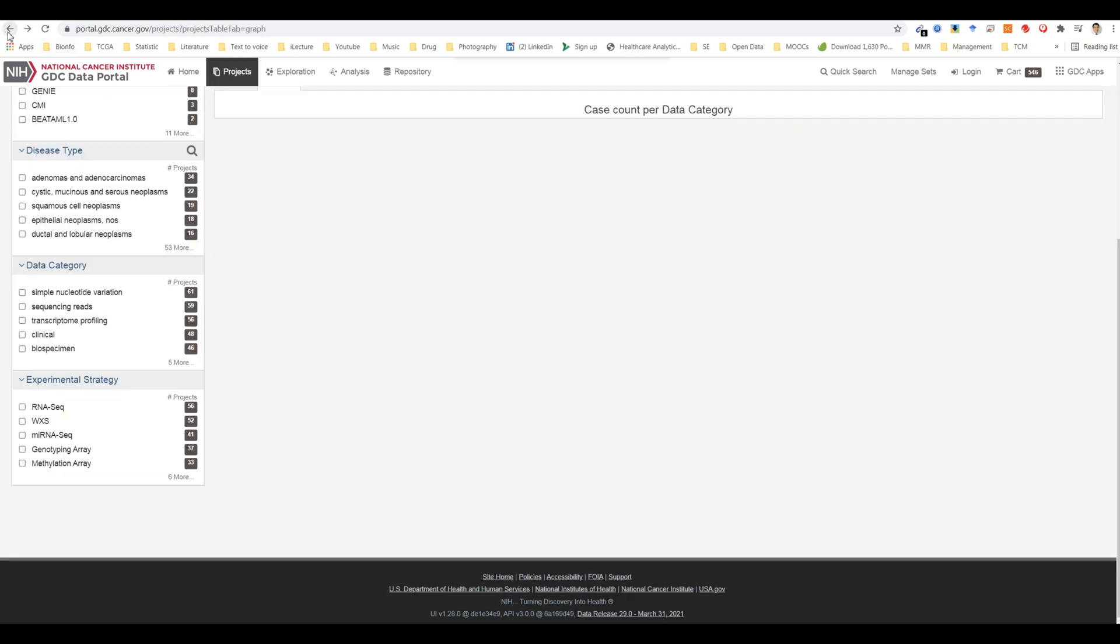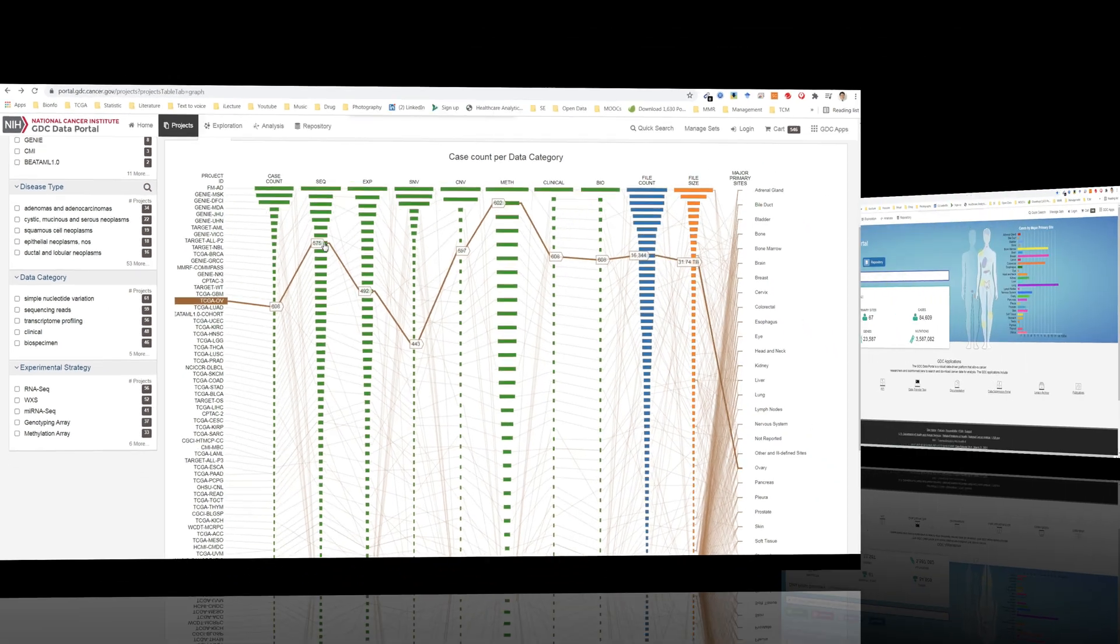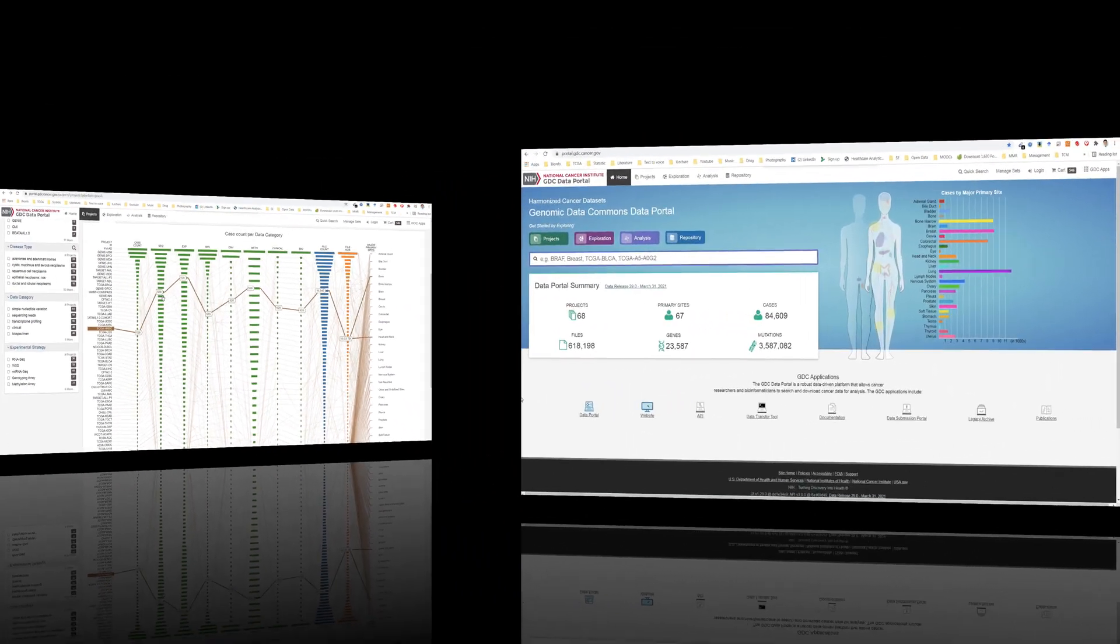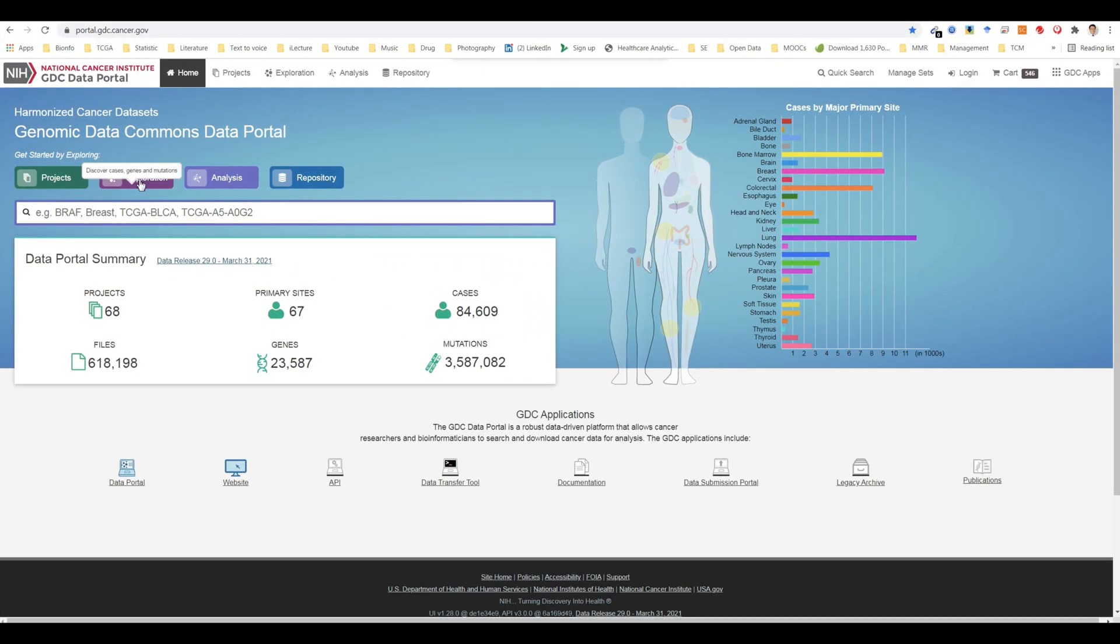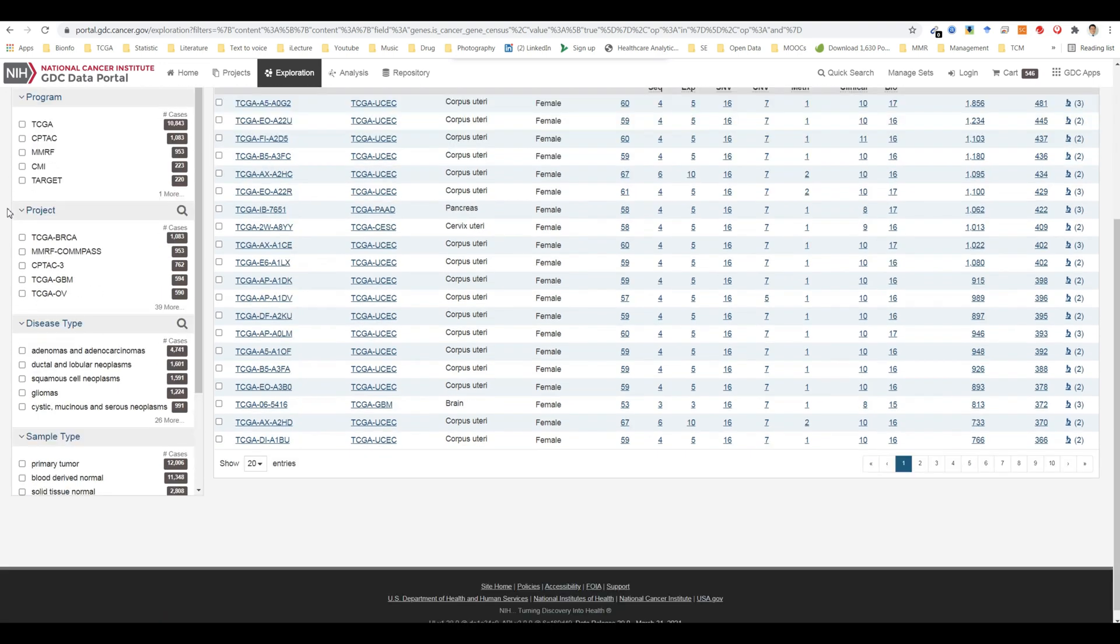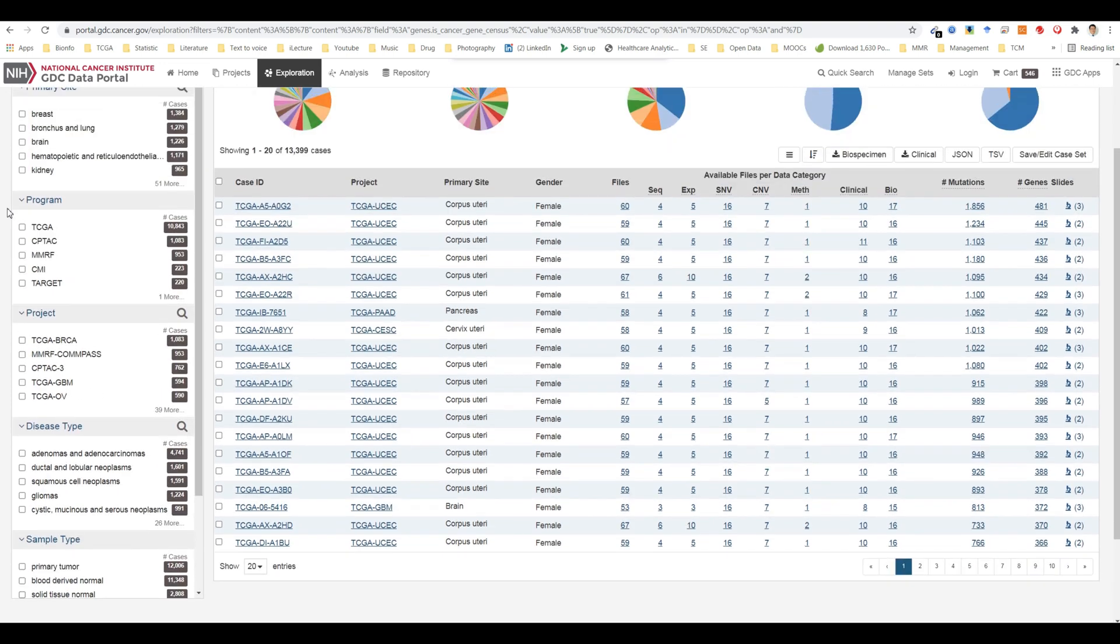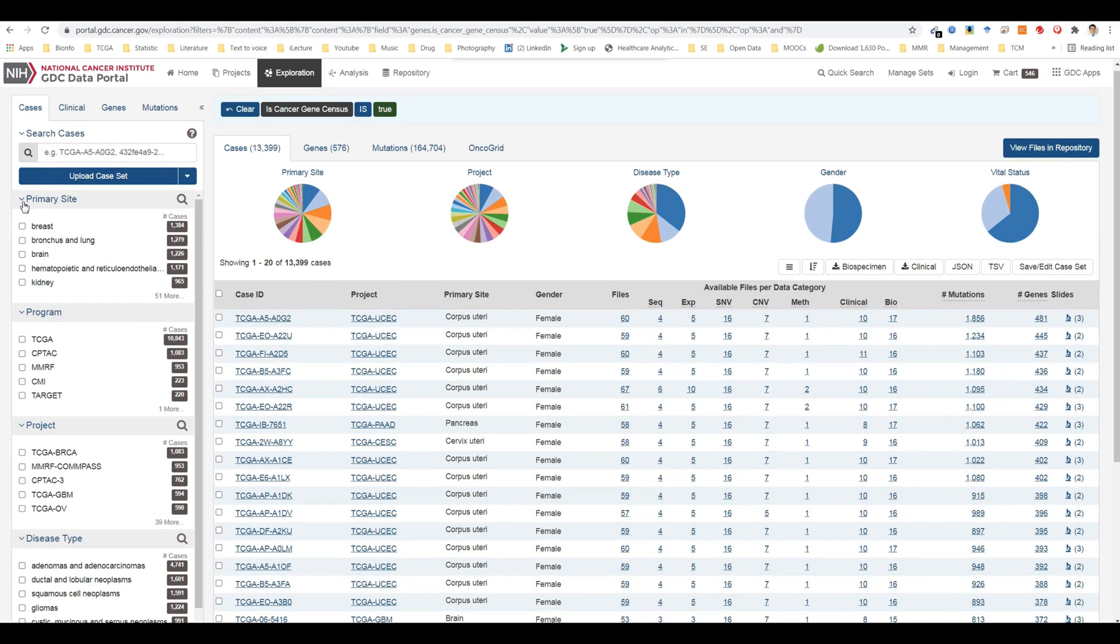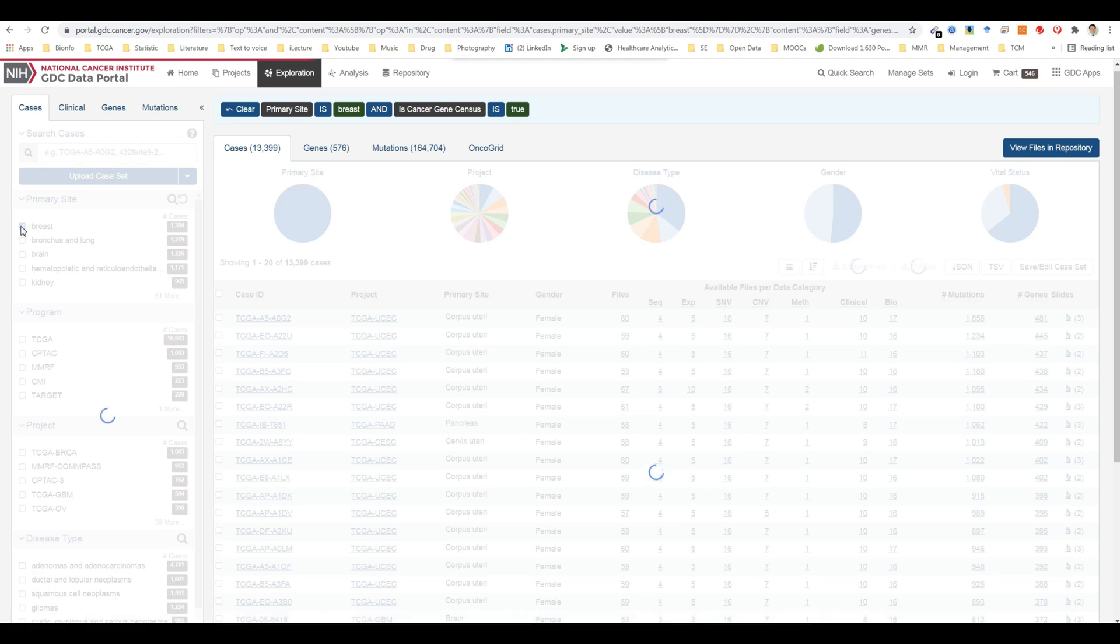The exploration page allows users to explore data in the GDC using advanced filters, which includes those on a gene and mutation level. Users choose filters on specific cases, genes, or mutations on the left of this page and then can visualize these results on the right.